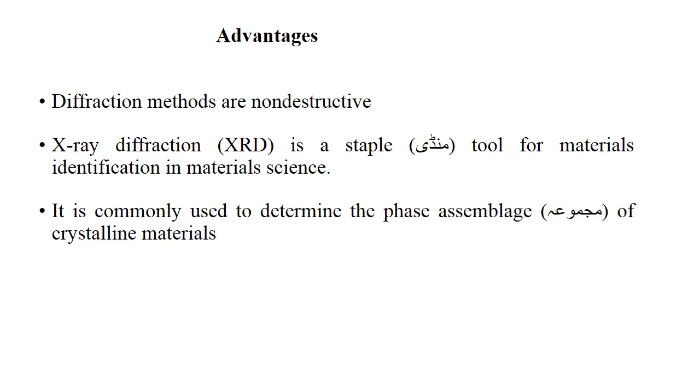What are the advantages of X-ray diffraction? X-ray diffraction methods are non-destructive. It means the sample remains unchanged and may be analyzed further by using a different technique. Actually, non-destructive techniques are those where, once the experiment is performed, the sample is not degenerated and remains unchanged.